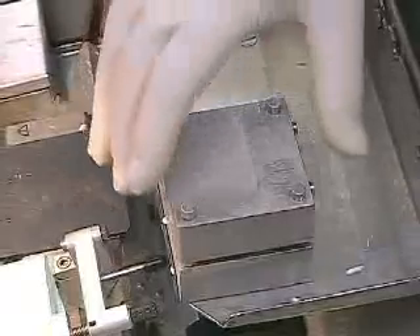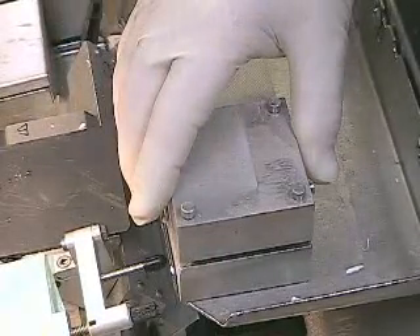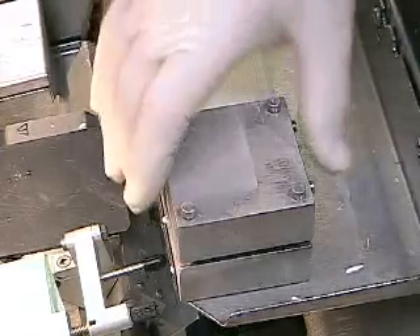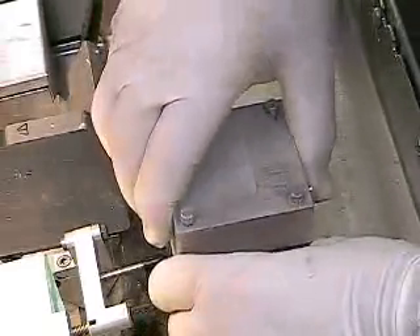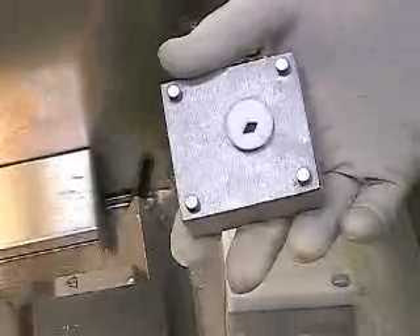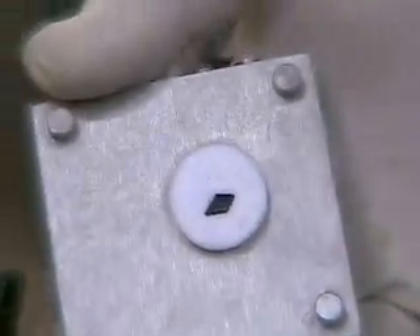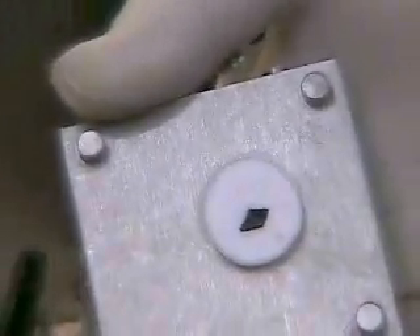After about 40 or 50 seconds you can test to see if this is frozen by very gently just trying to move it. If it feels very solid, it's ready to come off. Now to me this is feeling solid, so in order to remove it I'll just give a minor pull or turn. And there you can see that tiny sliver of skin with its ink surface down is now frozen into a block of embedding medium about the size of a quarter.